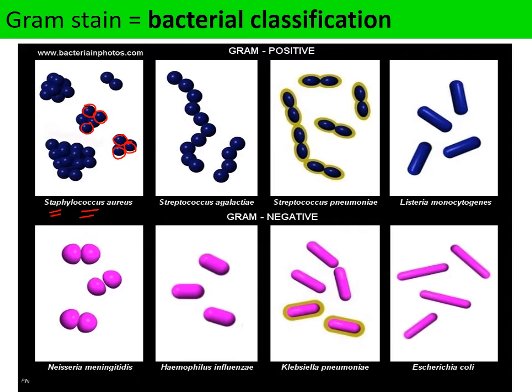Now, if we look down the microscope and we see a slightly different species of bacteria, whereby they are still cocci bacteria, so they're spherical, but this time they're not in clusters, they're actually in chains of cells all attached to each other, as we can see here in the second picture. They're called Streptococcus. So this is a nice example of a Streptococcus species of bacteria. These spherical bacteria are attached together but in a chain formation.